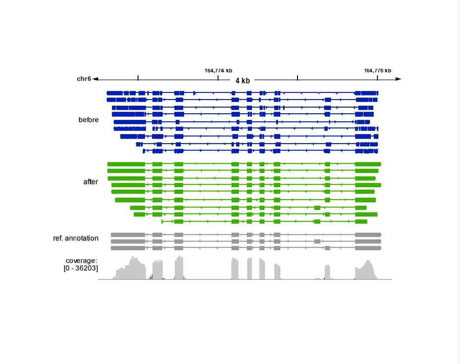Yes, this was a weakness of our original approach, in that if there was a bias or there was missing sequence in the secondary, say, Illumina data, that would be kind of projected onto the PacBio reads, and you would lose some sequence in those areas. Recently, Sergey has added a module to the pipeline that in areas where there's no coverage of secondary sequencing, we can use the PacBio reads themselves to fill the gap. So Serge, can you flip to the consensus figure?